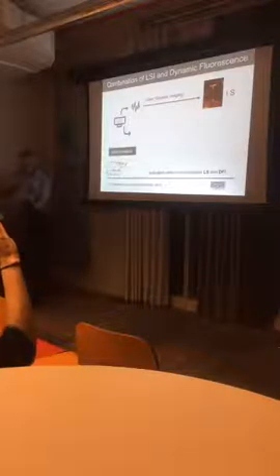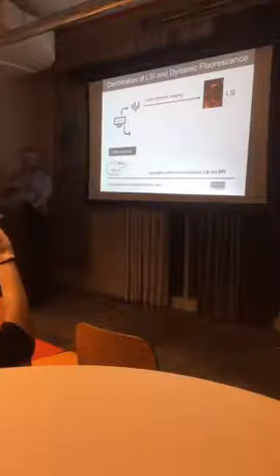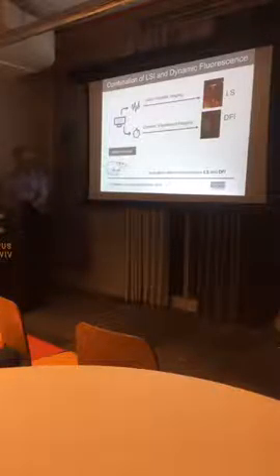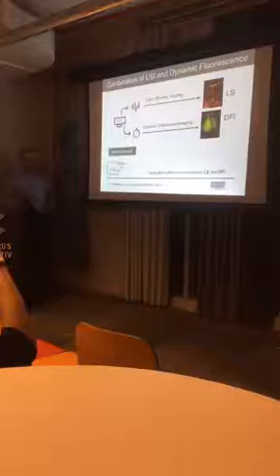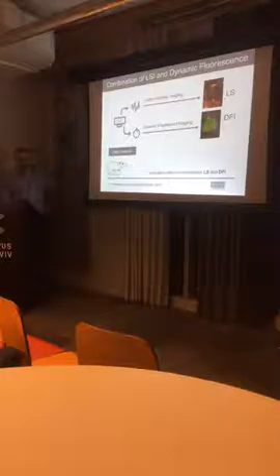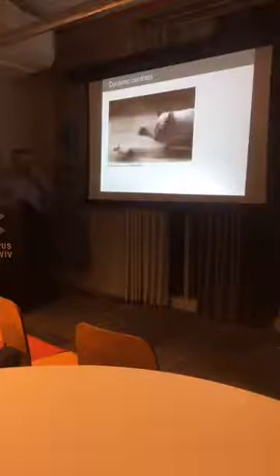In addition to the laser speckles, we can add fluorescence as well. What is interesting is that this is not a static fluorescence; we use dynamic fluorescence, and with it we can get much more information. We call it dynamic contrast.